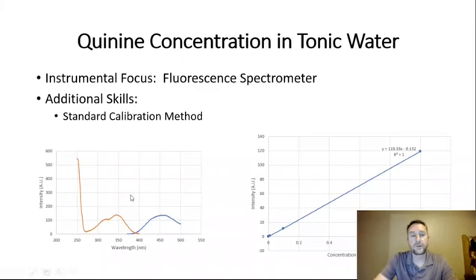And then the side focus was that they were practicing standard calibration methods. So that's another piece that you're going to see as we go through this: the students really need to be sure that they're getting exposed to a variety of calibration methods, because out in the workforce, they'll encounter all of these. So we want them to have some familiarity with all of the calibration methods.